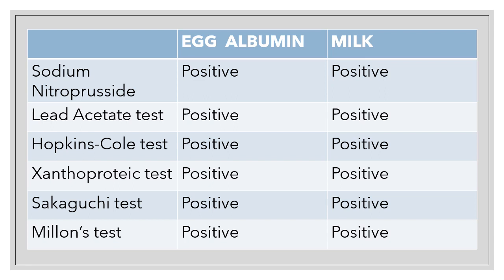Okay, so it is difficult to remove the stain, because your nitric acid can penetrate deeply into the stain. Nitric acid, being a corrosive substance, can penetrate into the pores or interstices of materials, and once it has penetrated deeply, a simple wash is not efficient, it's not enough to remove the stain of your nitric acid.